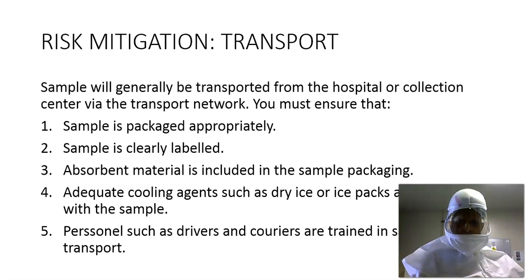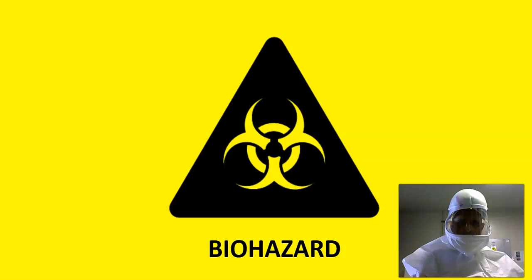Personnel such as drivers and couriers must be trained in sample transport and must be aware of the risk posed by the biological agent contained within the sample. This is one of the symbols which are generally labeled onto samples. This is the symbol for biohazard.